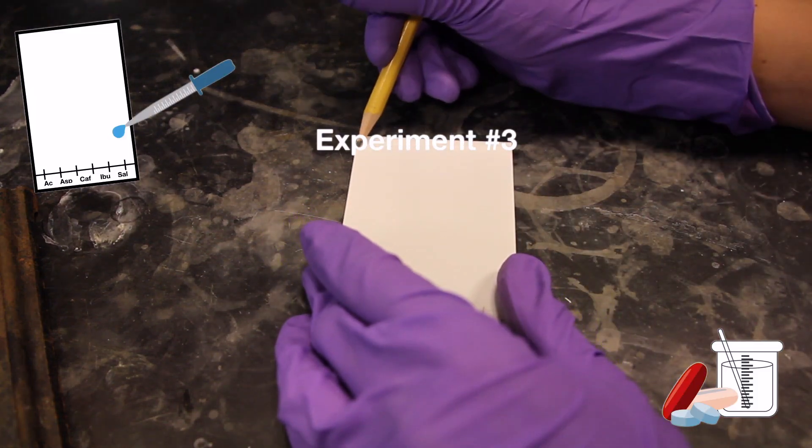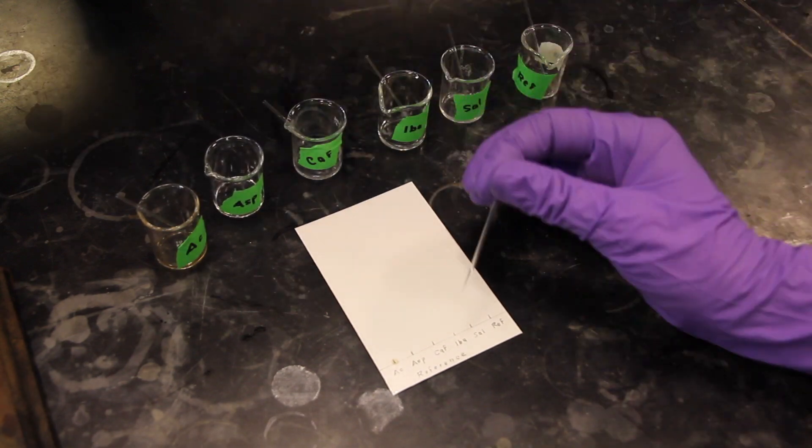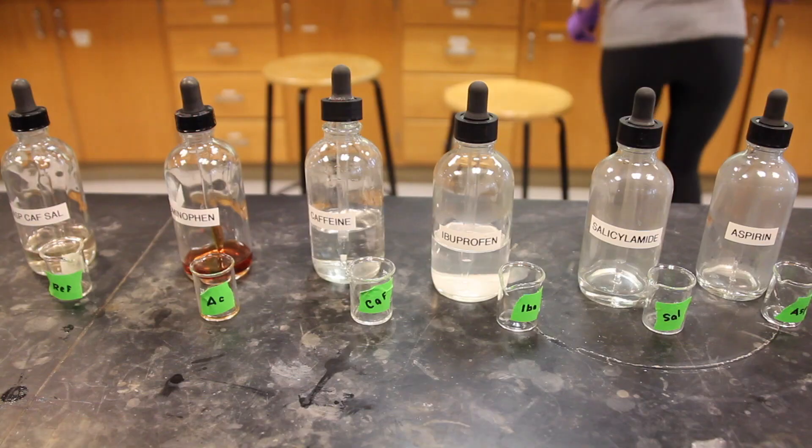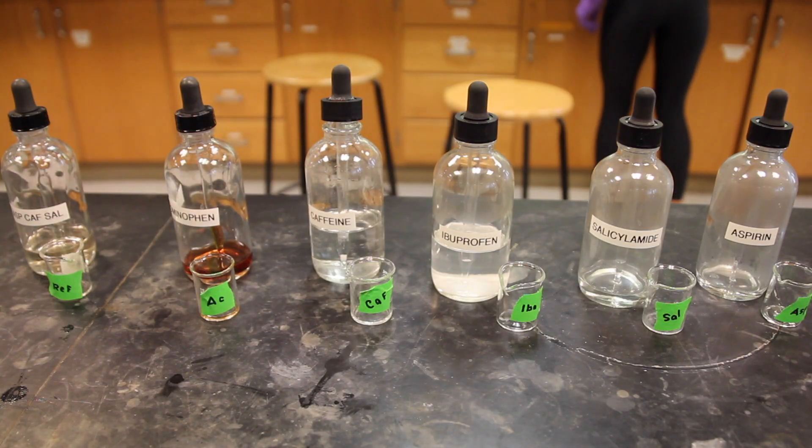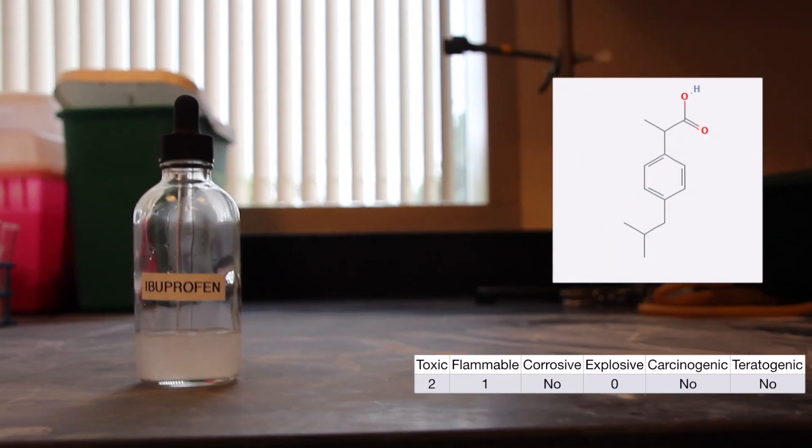In this experiment, you will use thin layer chromatography, or TLC, to analyze the components of some common over-the-counter pain relievers. The compounds that have been chosen for this analysis are acetaminophen, aspirin, caffeine, ibuprofen, and salicylamide.